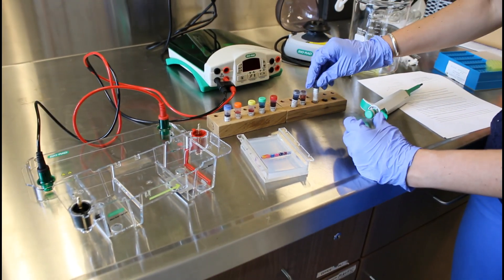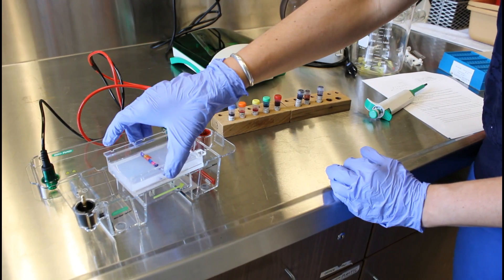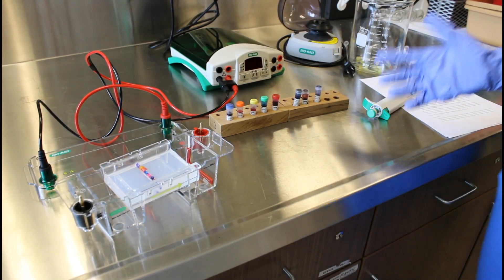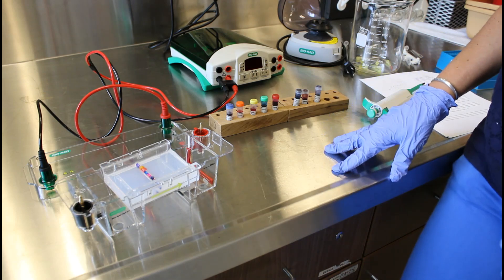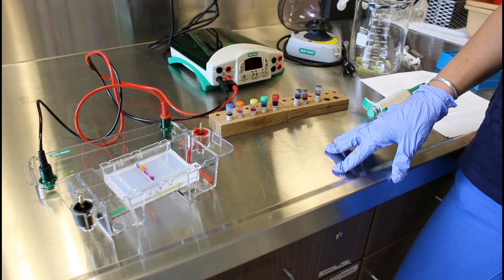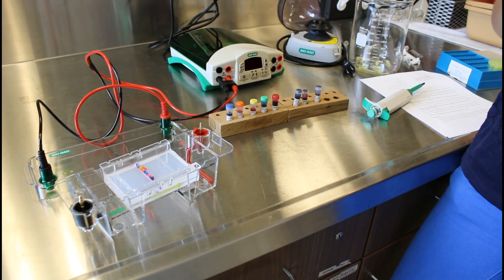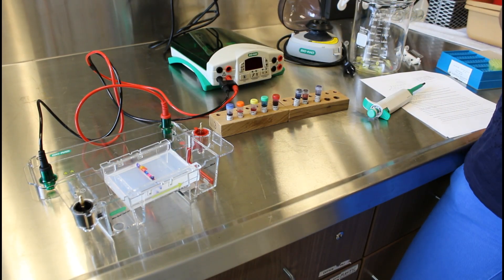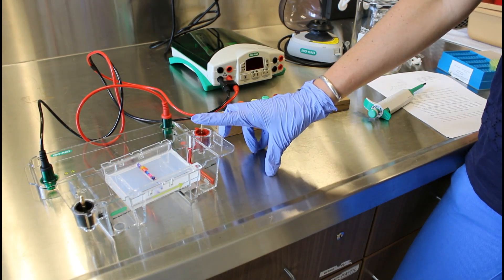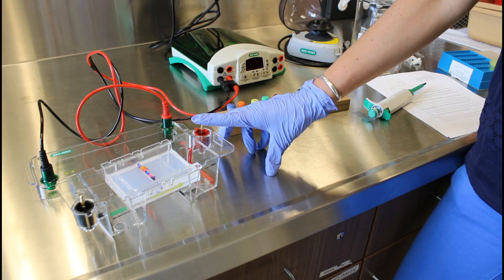The gel has been loaded with the dyes. And now I'm going to put it in the electrophoresis chamber. So normally when you do gel electrophoresis with DNA, you put all of the wells on one side of the gel. Because DNA is a negatively charged molecule, it's always going to move towards the positive electrode.